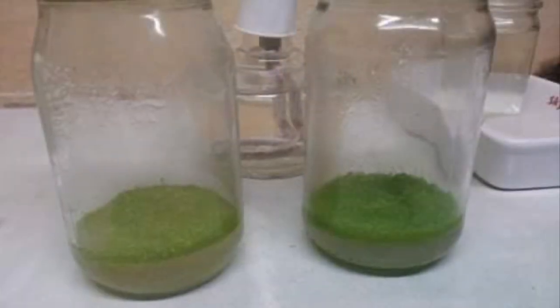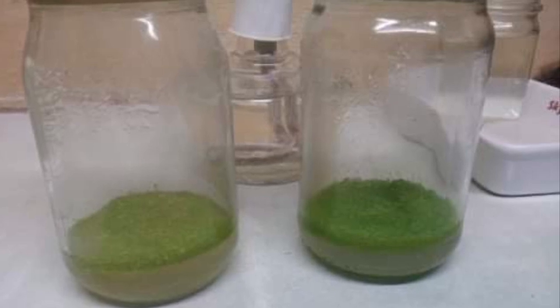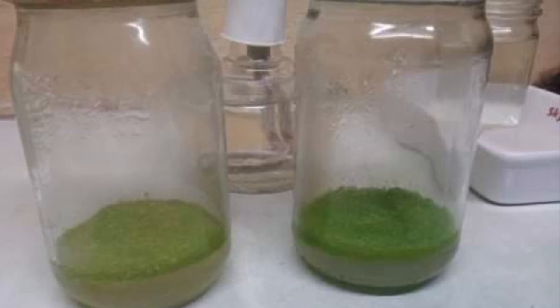Two months after planting, the protocorm grows and fills up the media surface. The protocorm may then be transplanted on the third or fourth month after planting.